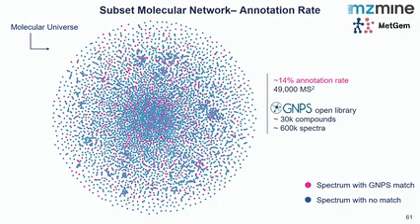And before I start, I think this is a very nice visualization of what is actually happening. So we got the first compound library, we acquired the data, and then each node here is one MSMS spectrum. We clustered them based on their spectral similarity, so they are covered in the chemical space. And then each node that got an annotation in GNPS, which is the biggest open spectral library, gets a hit and is highlighted in magenta.